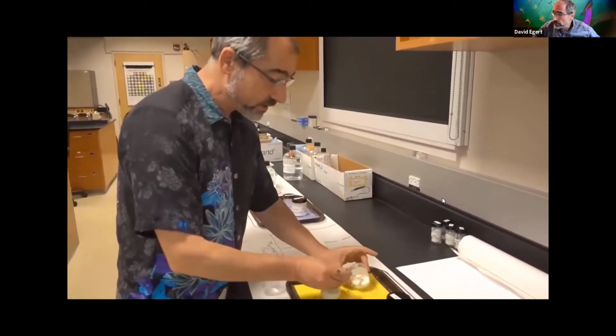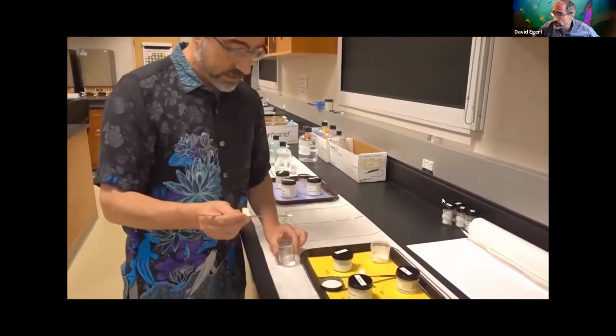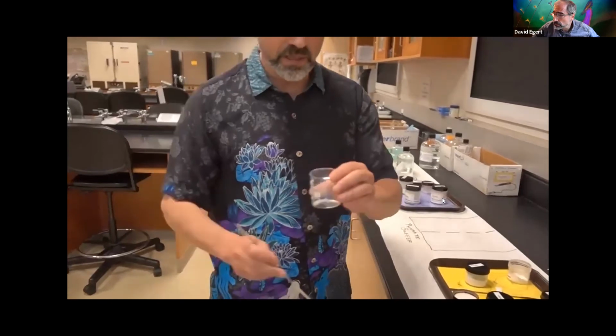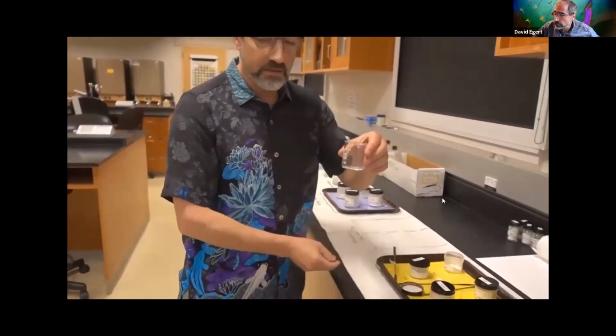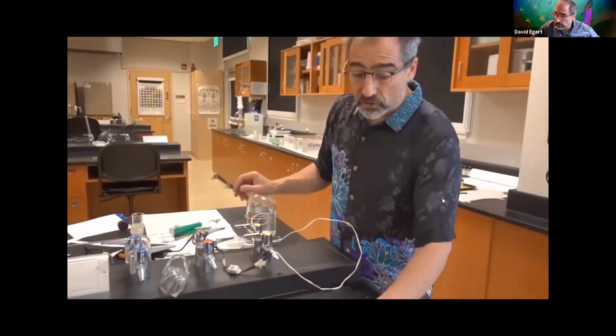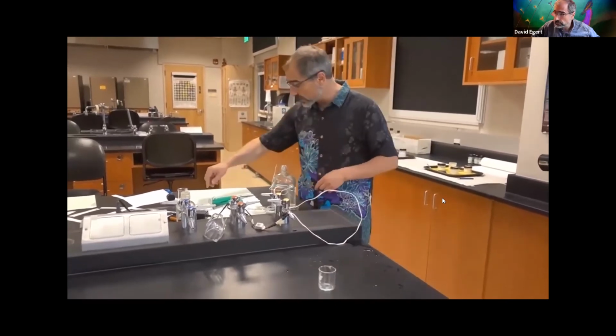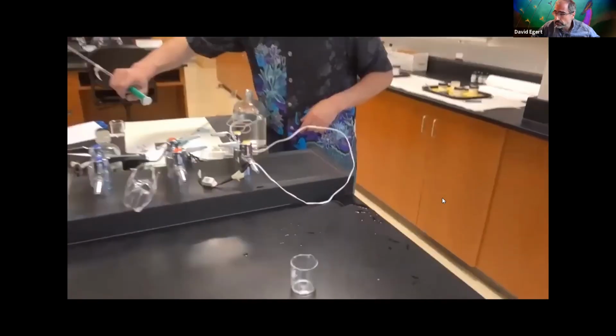Take a pinch, and I add it into my little beaker. I don't need to label this because it's only one electrolyte. So this is the salt. If you take a look at it, it looks like salt.